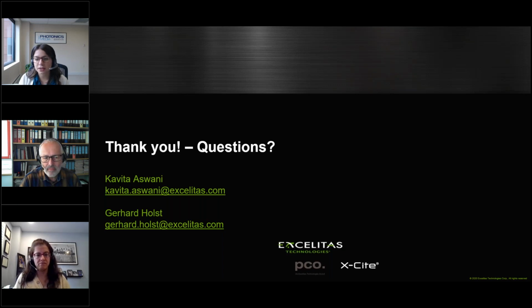This next question is, how can I use the camera with my own software? Well, that's relatively easy. We offer a free software development kit, as well as support for some of the classical, let's say, third-party open source software packages. So there will be support for Micromanager, and maybe we'll get some support from the software packages offered by the microscope manufacturers. We are working on that.